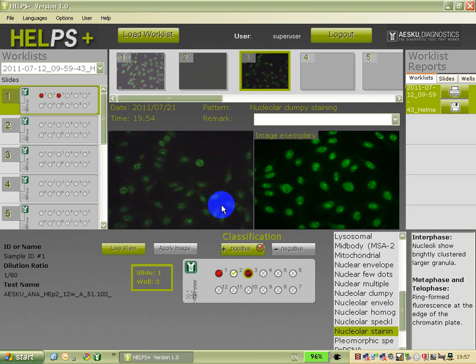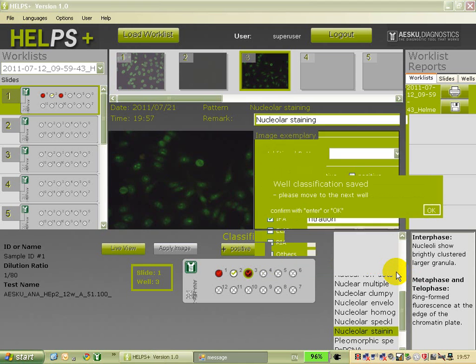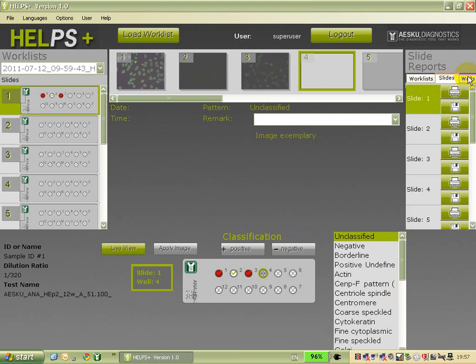So we select yes, and we have finished reviewing these 3 results, which for this demo purpose is enough. And we press OK.